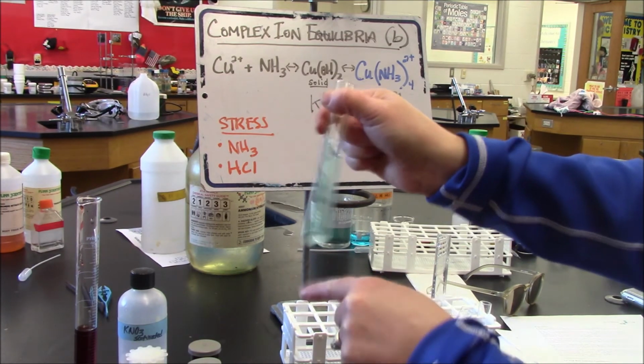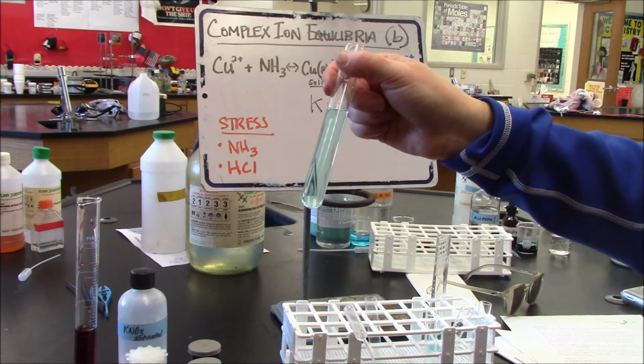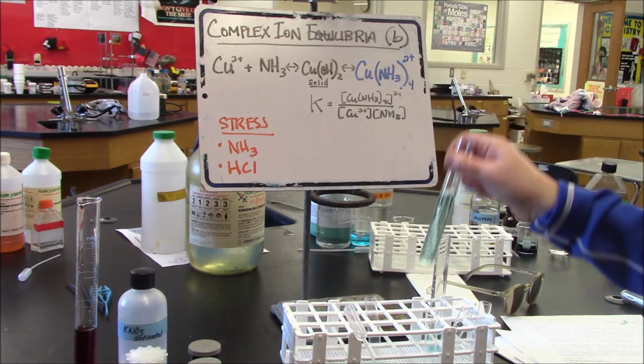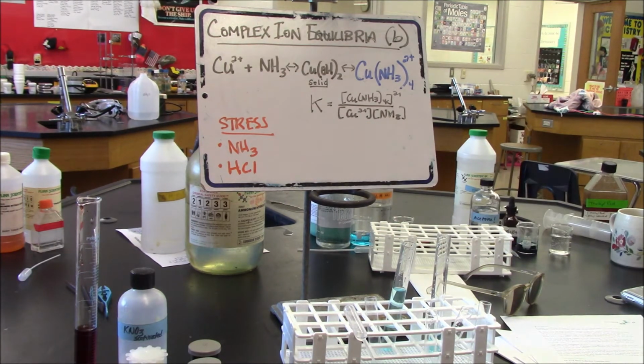All right, so obviously this is a little bit more dilute, so the blue color is not exactly the same as it originally was. But hopefully you were able to see how the addition of these two substances stress the equilibrium and how the equilibrium responded as a result.